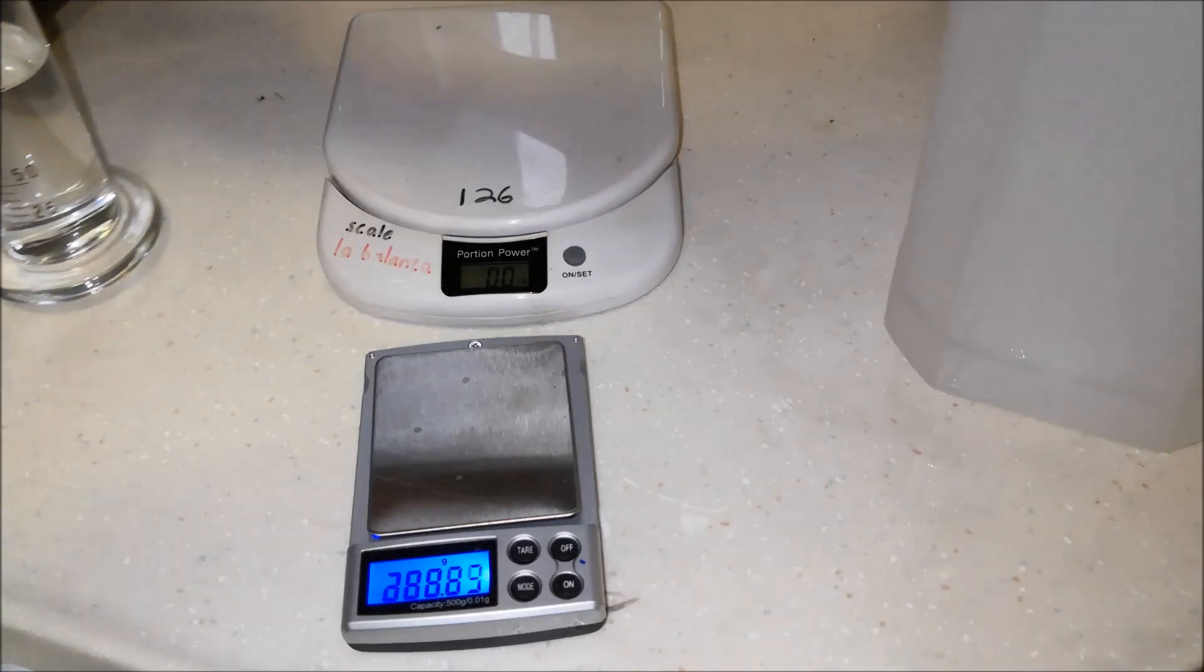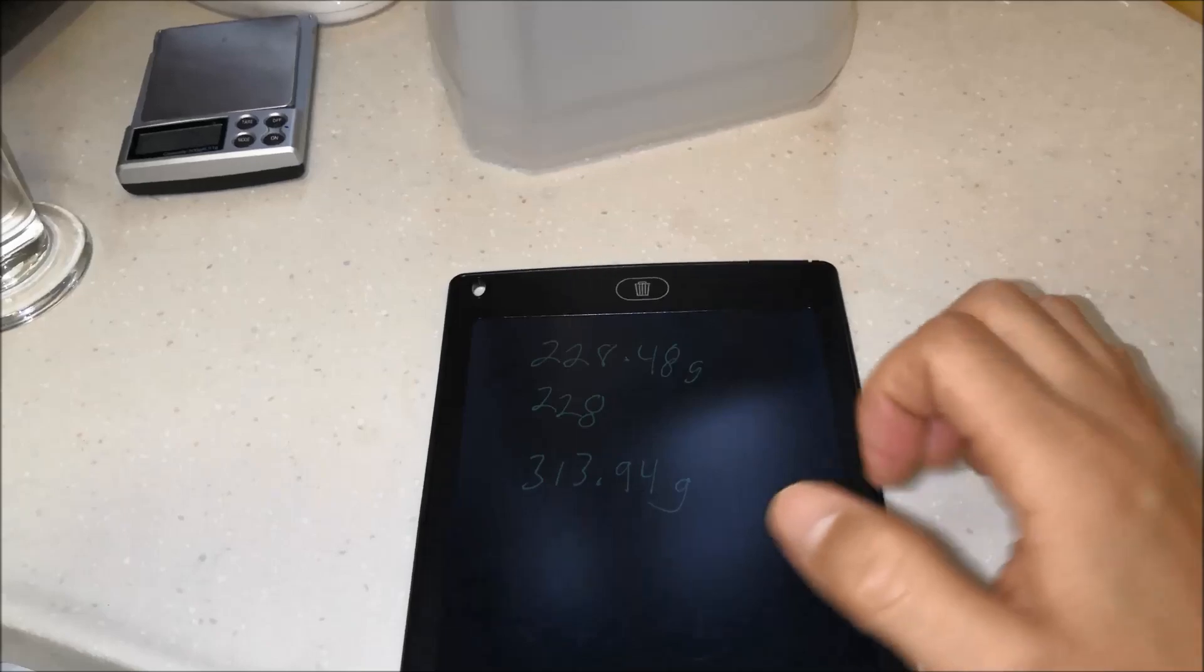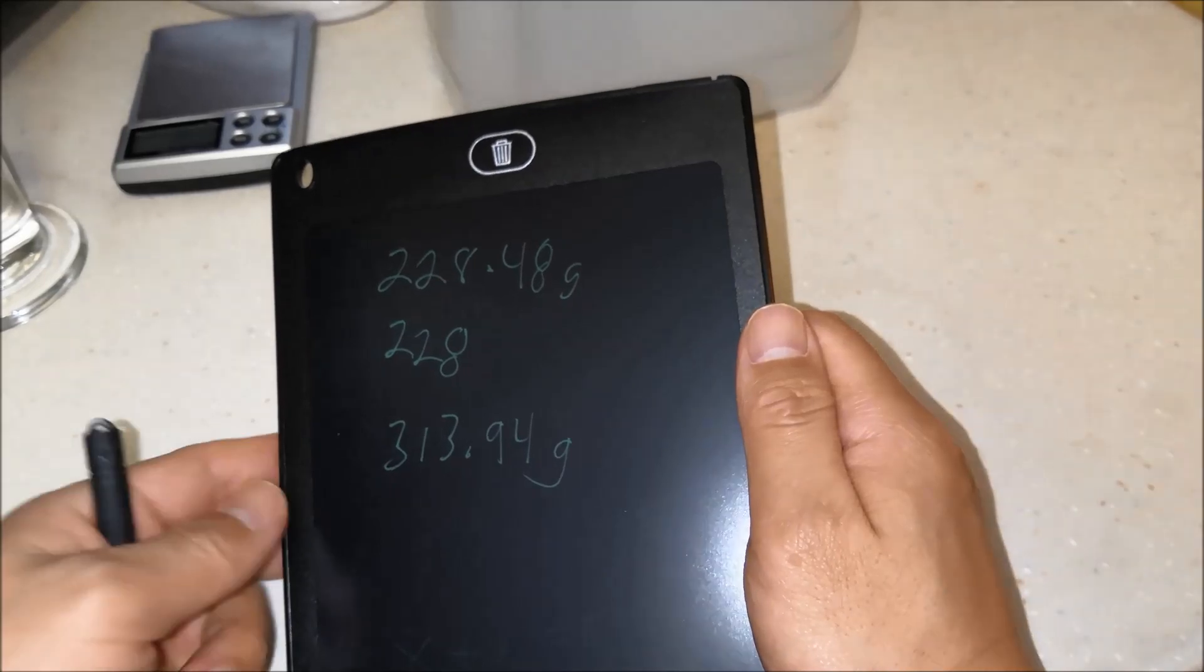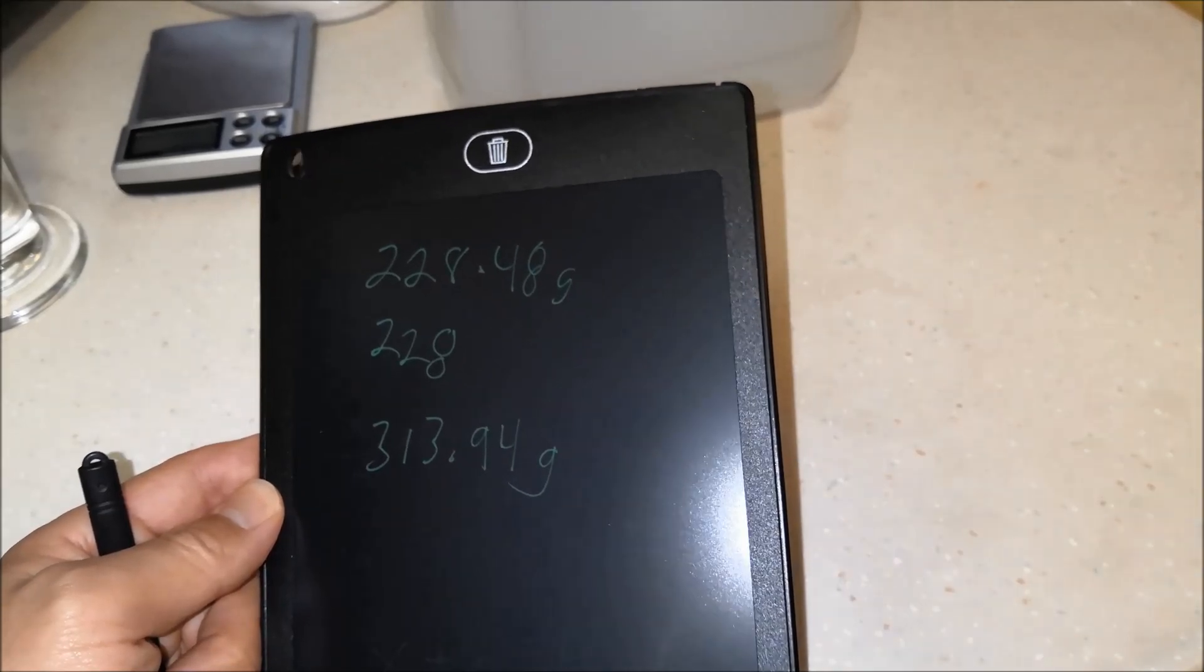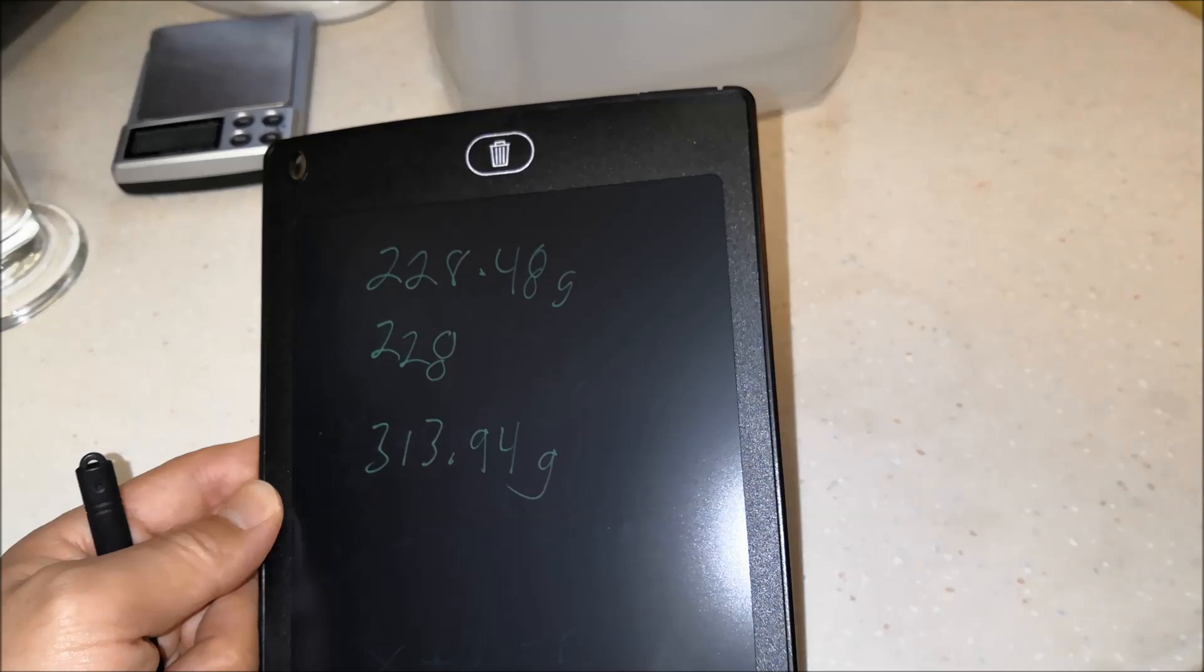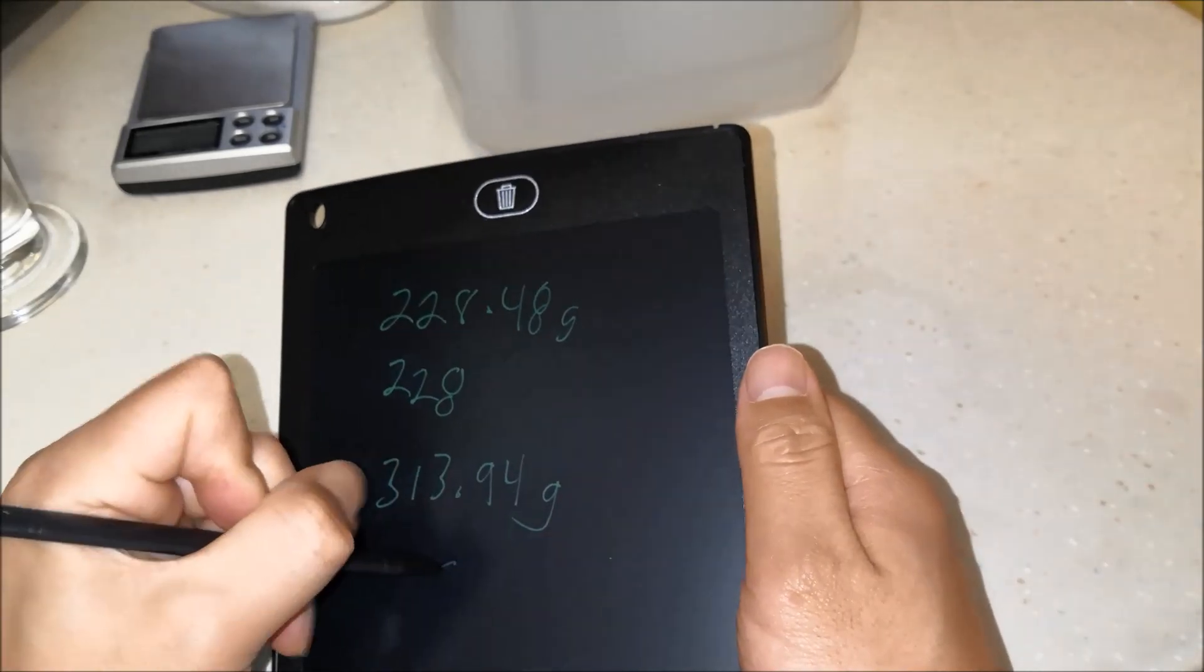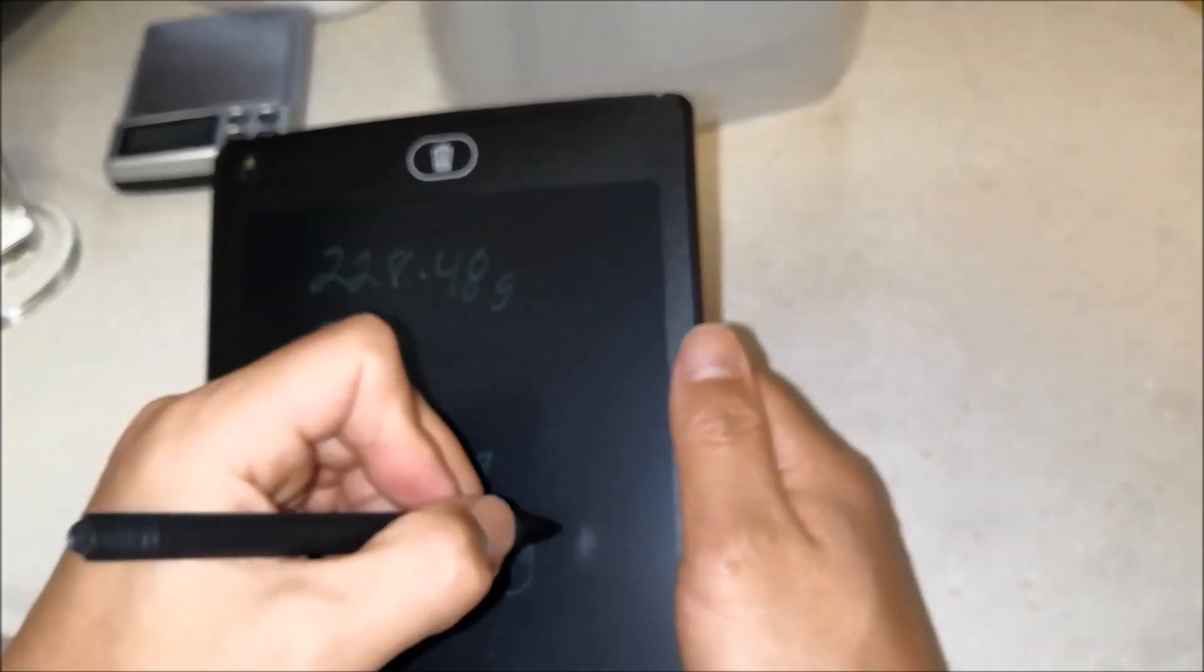So let's set this aside here. And we've got some alcohol on the table. Let's wipe that off. Okay. So this means we've got to do 313.94 and take off the weight of the cylinder. Let's see. What's 313.94 minus 228.48? The answer is 85.46. Okay. 85.46 grams is the mass of 100 milliliters of this isopropyl alcohol.